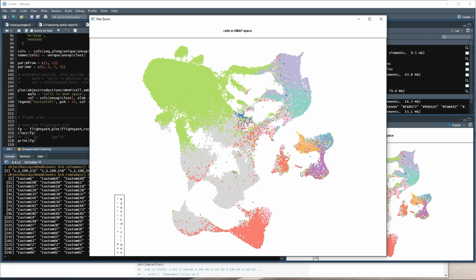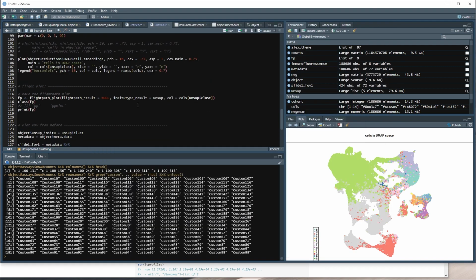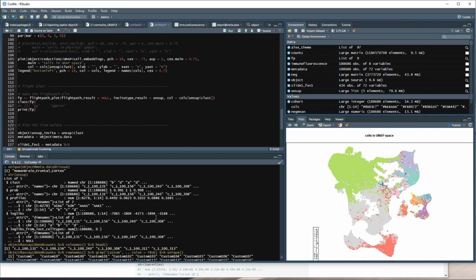And remember that this is only a two-dimensional representation of our UMAP, which used 50 PCs. Maybe it was 30 PCs of the principal components we have 50 of. But now we have our InSituType assignments for our clusters on top of our UMAP. So to view the confidence that we have, remember before I mentioned that we have those posterior probabilities for our different cells. So here this one looks really, oh, I might be looking at the wrong thing.